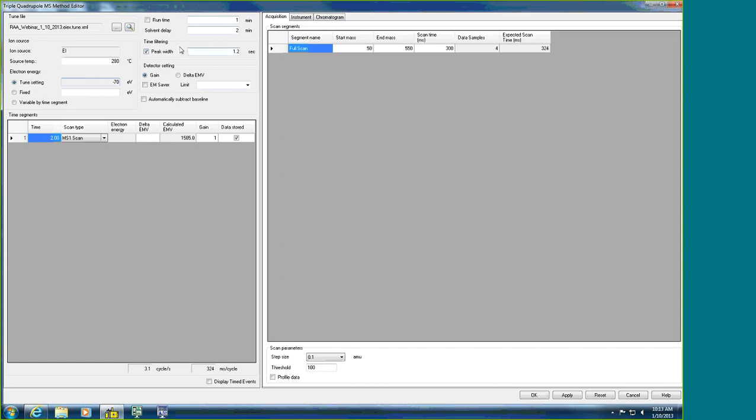If you want to set up a solvent delay, you can do that here, whatever that may be. You could have the mass spec acquire for only 1 minute. However, if you leave this box unchecked, the mass spec will acquire for the duration of the GC run.